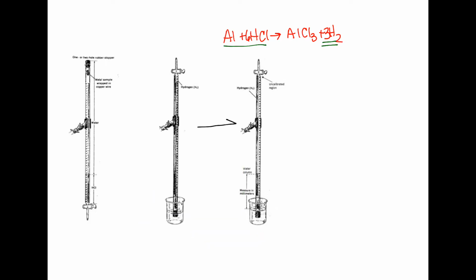All right, when our reaction is done, we will know it's happened because the bubbles have stopped forming, so we aren't getting any more bubbles. And when the reaction is done, we're going to have an area up here of hydrogen gas that we've trapped. The rest down here will be water, and all of our metal will be gone. So all the metal will be reacted.